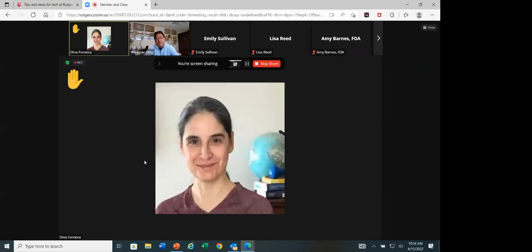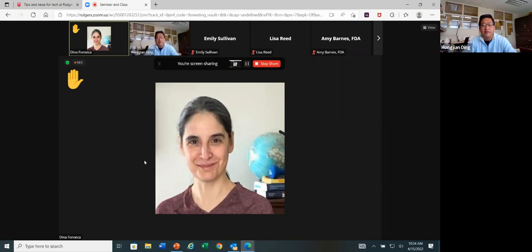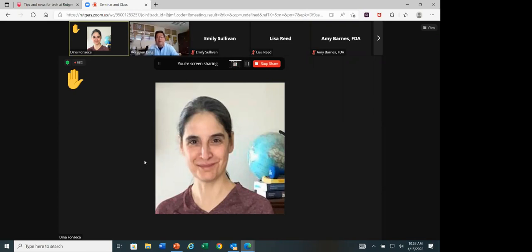If you don't mind, I have a follow-up on that. This is Dina. Because you're optimizing this approach, trying to make it more sensitive, are you going to have to change your thresholds for deciding if something is bad or good, or for rejection or acceptance of a food item?